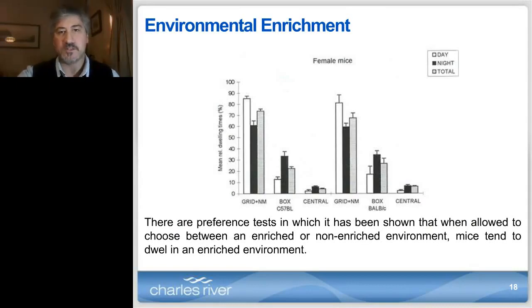Let me touch a little bit on environmental enrichment. There is a lot of discussion on environmental enrichment. So I'm not going to go into details about whether environmental enrichment is good or bad, or good for certain experiments but not for behavioral studies and things like that. What I would like to bring here is that environmental enrichment is another factor that may alter or may influence our experimental results.